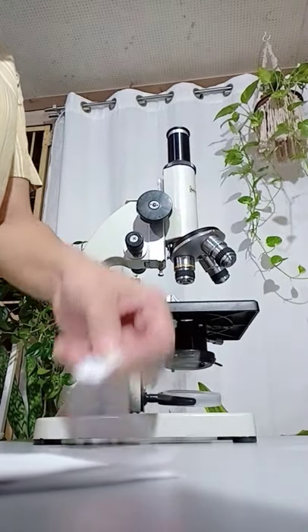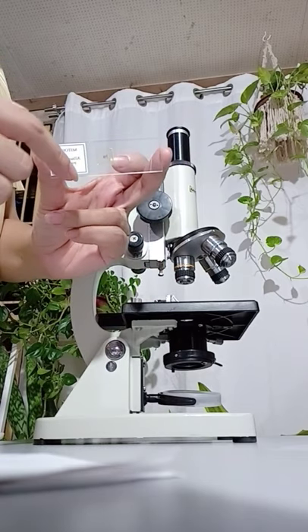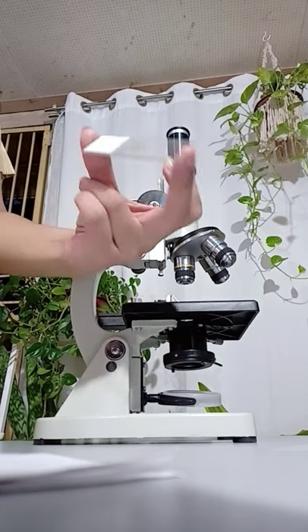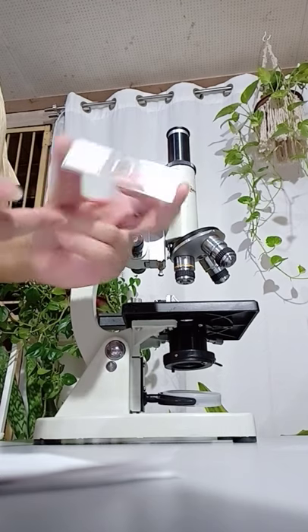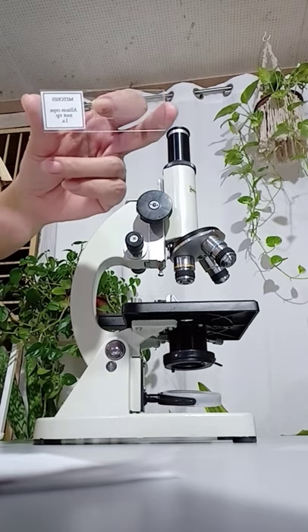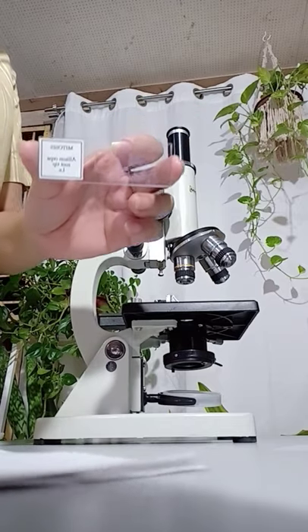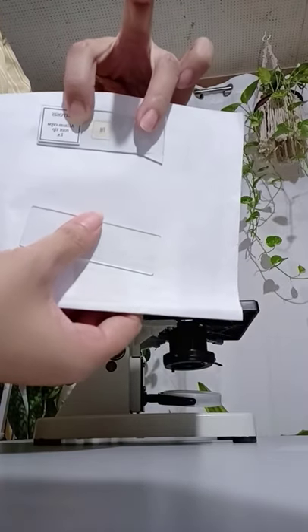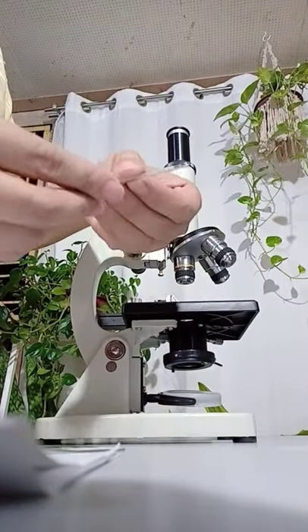Another is called a prepared slide. A prepared slide can be purchased from companies that prepare them, and they already hold a particular specimen. In this case, the label is Allium Cepa root tip, or in English, Onion Root Tip. The letters LS stand for Longitudinal Section. This is an example of a prepared slide — the specimen is already mounted. The other one I prepared myself using a cut-out of a small letter E.